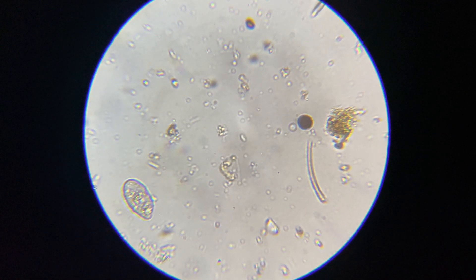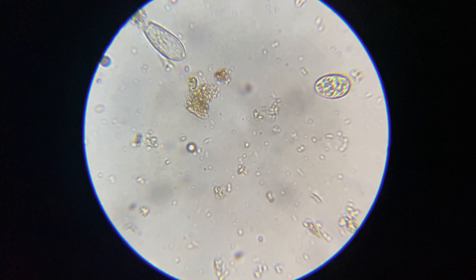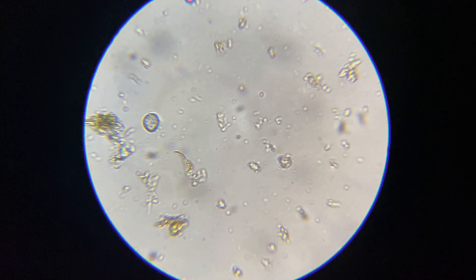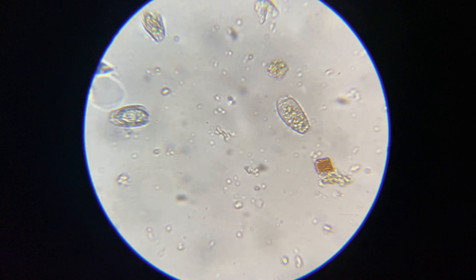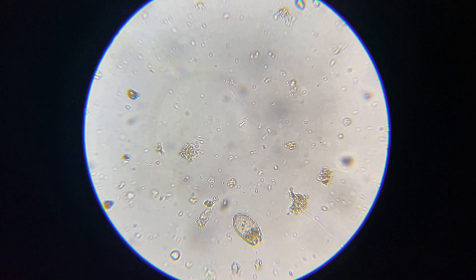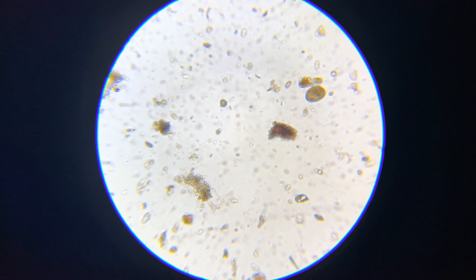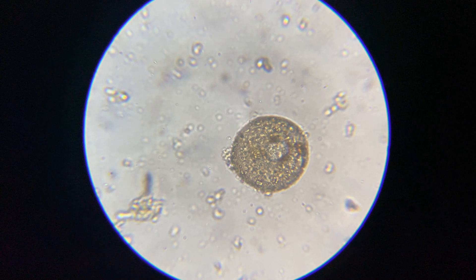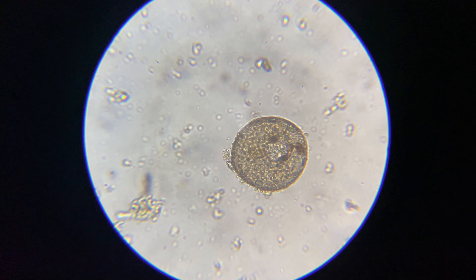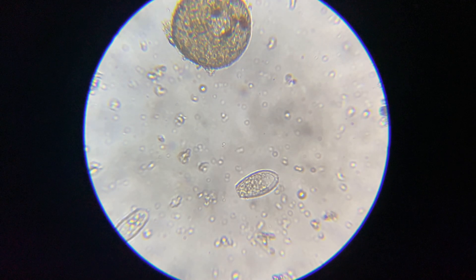You can see more testate amoeba here and a little fungal spore — a little brown dot. Looks like an amoeba cyst there, which is basically like an amoeba egg. More protozoa here. We're seeing a lot of really good aerobic predators that are going to cycle nutrients in our system, creating more beneficial nutrient cycling. You can see a bunch of Arcella and more testate amoeba around them — these are the creatures we want to see the most because they cycle the most nutrients per day. Here's a really good shot of an Arcella; you can see all of those bacterial bodies inside of it. We're getting a lot of good predatory species within this extract solution.